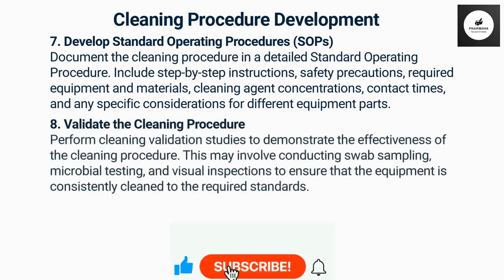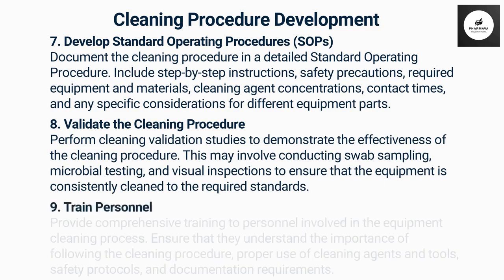Validate the cleaning procedure. Perform cleaning validation studies to demonstrate the effectiveness of the cleaning procedure. This may involve conducting swab sampling, microbial testing, and visual inspections to ensure that the equipment is consistently cleaned to the required standards.